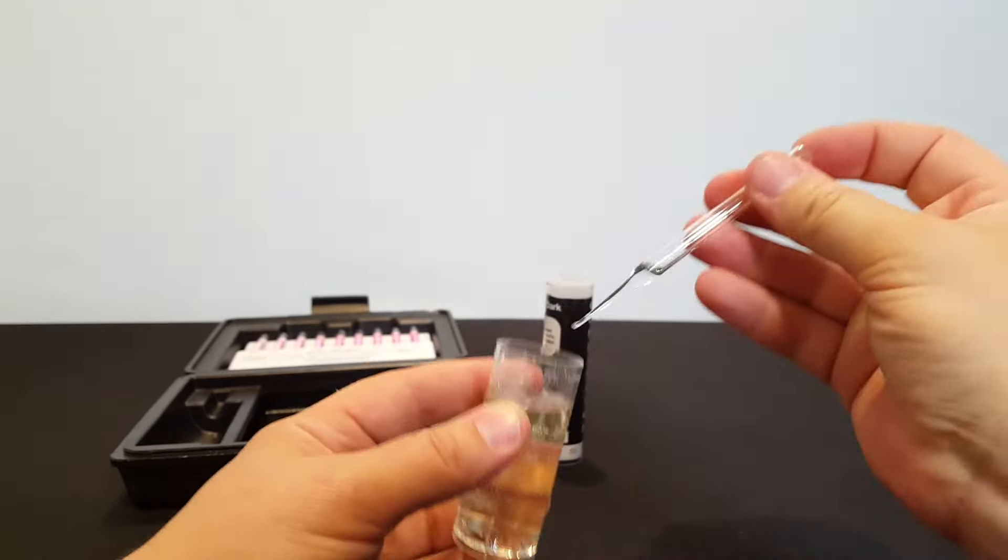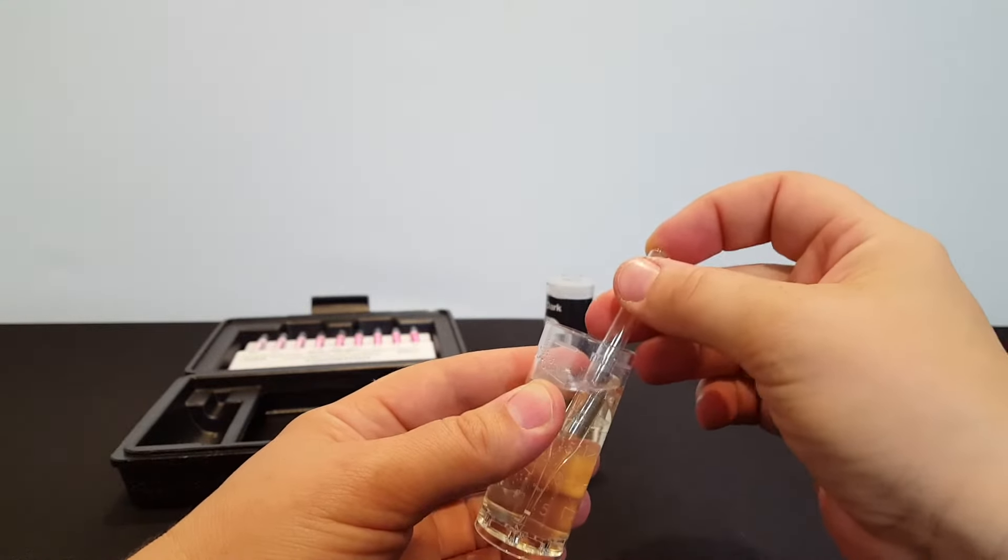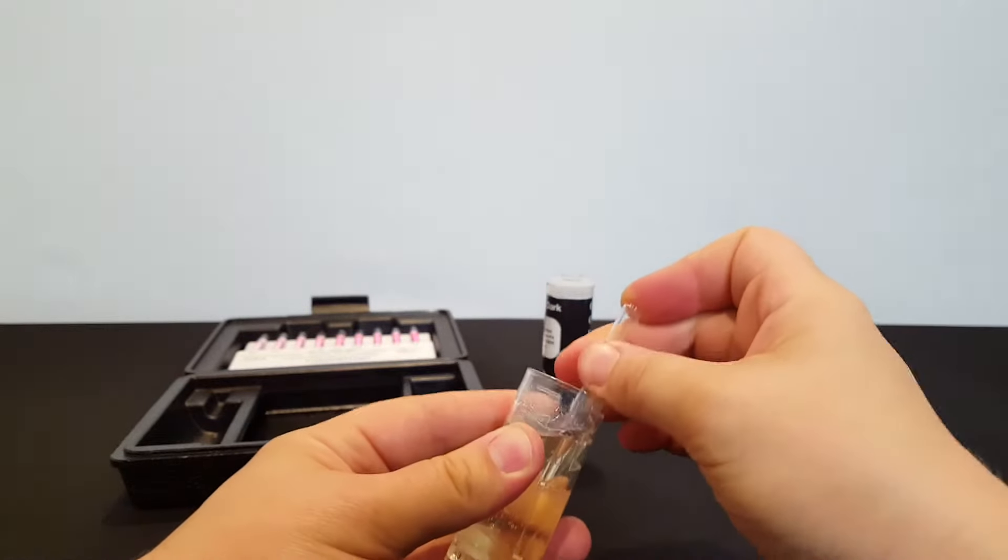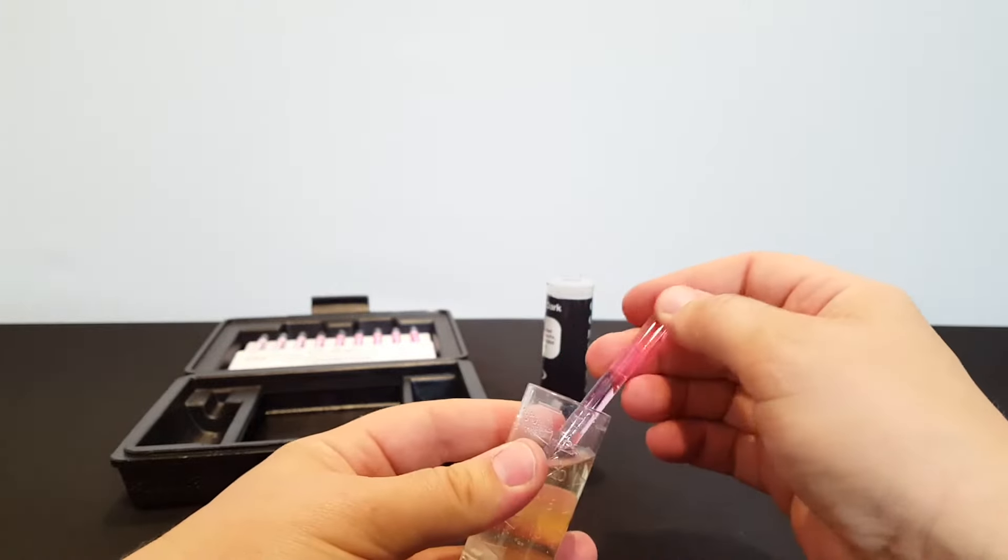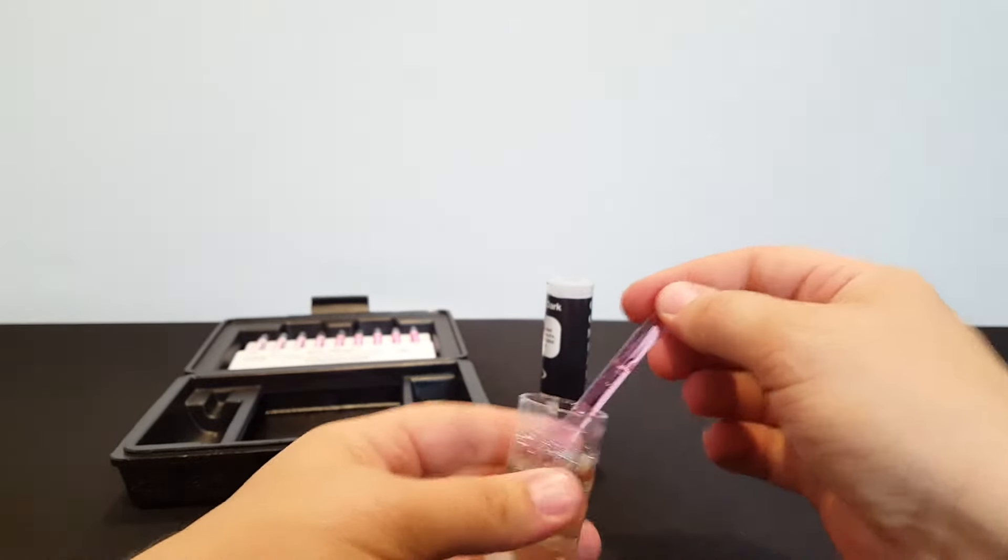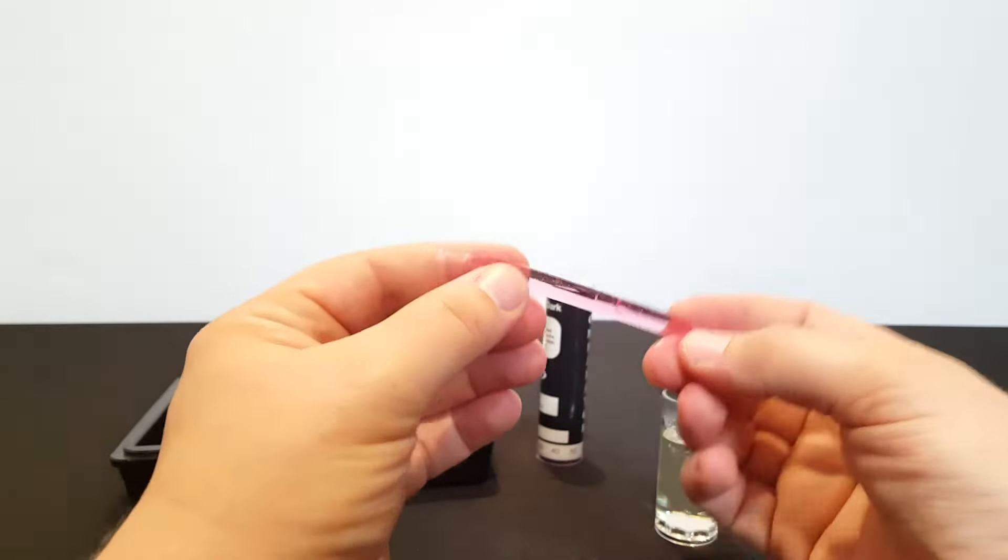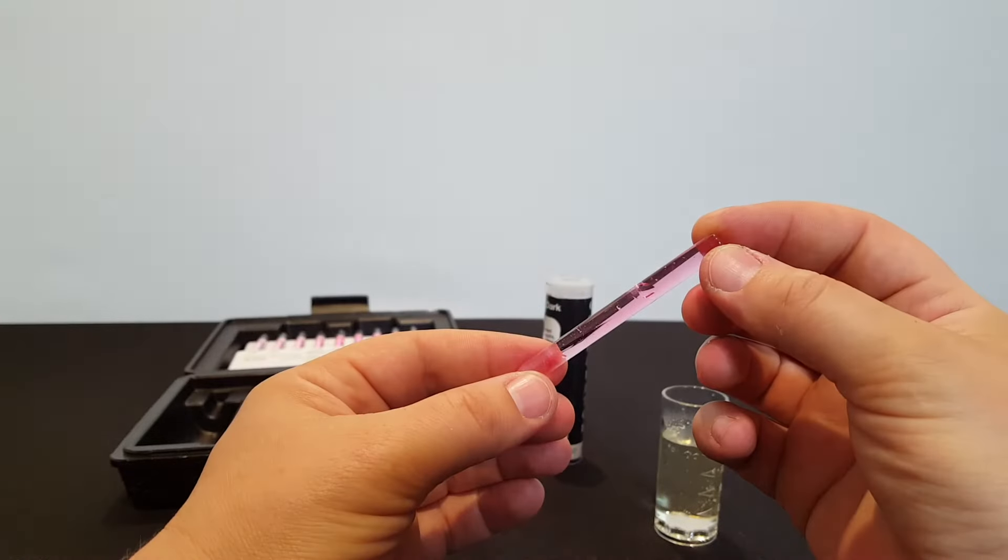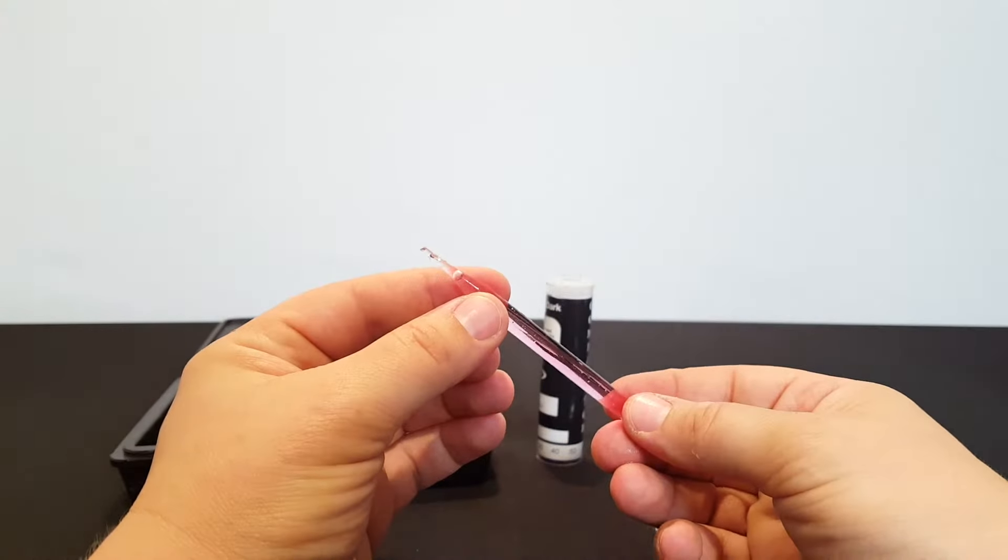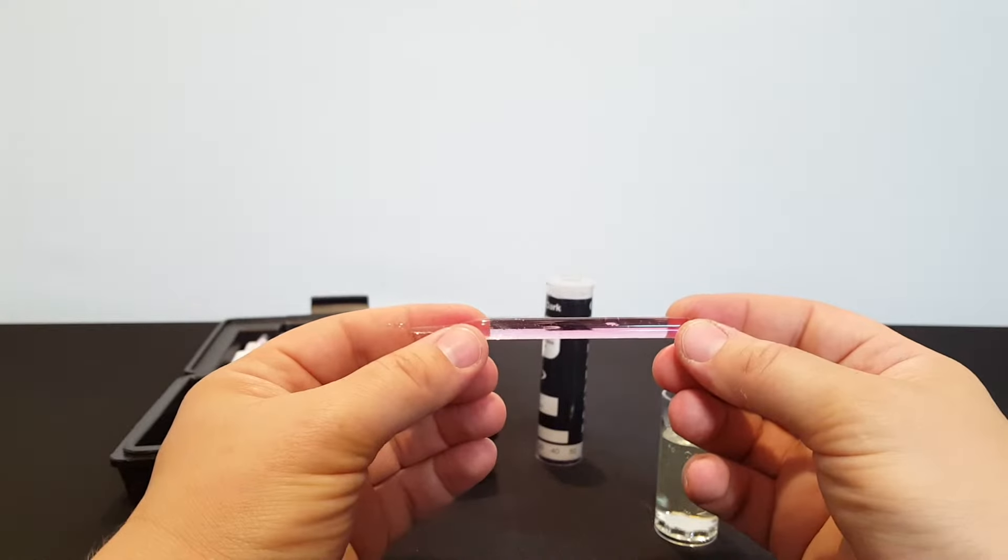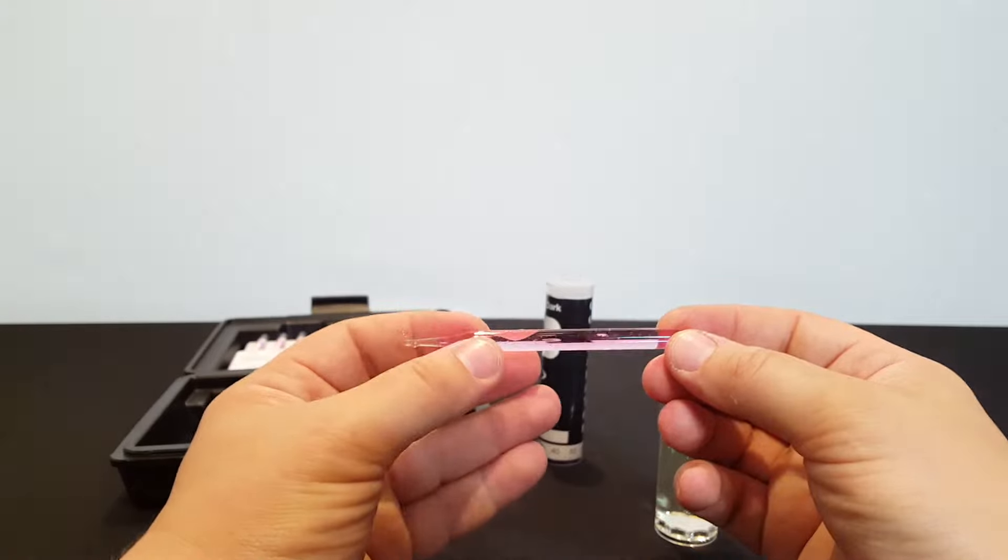So pick up the ampoule, you swirl it a few times, you snap off the end. When you snap off the end, it's vacuum sealed on the inside, so it instantly draws the sample up into the tube. You'll want to tilt it back and forth and move that bubble back and forth to make sure it's thoroughly mixed.